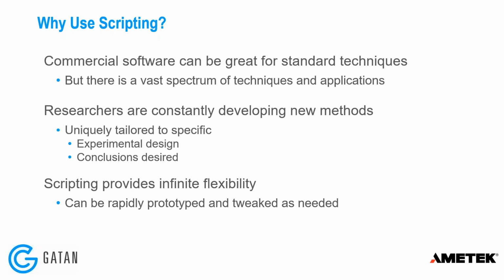And by their very nature, especially in academic research, researchers are constantly developing these new methods of data collection and processing and analysis. So scripting provides infinite flexibility for that type of work.